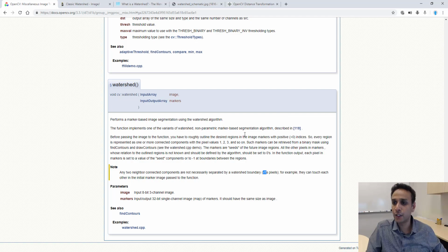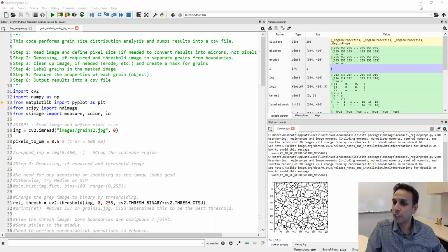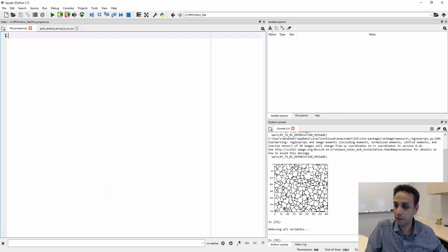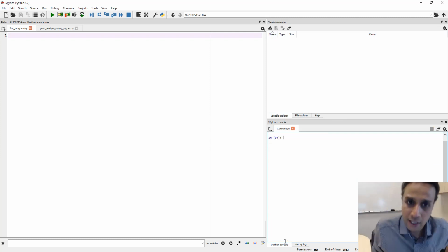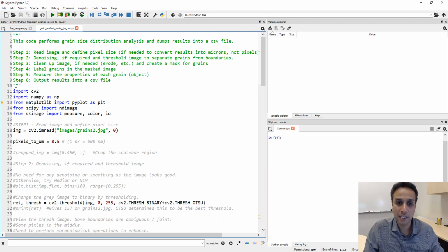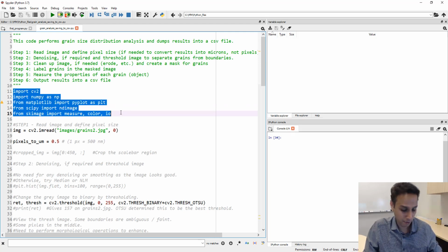So let's jump into the code and write the new code. Before writing it, let me erase all the variables from the last run. Let me clear the screen so we have all the room we need. I'm going to do some copy and pasting so we don't waste our time. Obviously we have done this exercise in the past using the traditional approach.